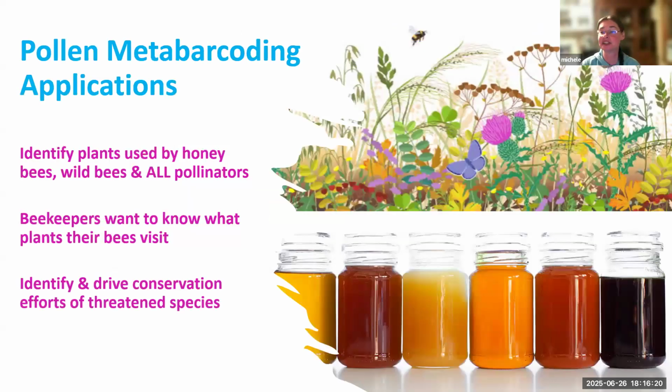Okay, so that's just a little bit of description about what metabarcoding is. So what does this mean for application, specifically to your group and your interests? Metabarcoding is great because I can identify any plant material that would be in a particular sample. It doesn't have to be strictly limited to honeybees. I've done studies with wild bees, usually with research groups, or basically any plant sample. My favorite so far has been someone studying hoverflies. I was also contacted by a group that's looking at hummingbirds. I would really want to come meet some hummingbirds and get some pollen samples. That just seems pretty awesome to me.